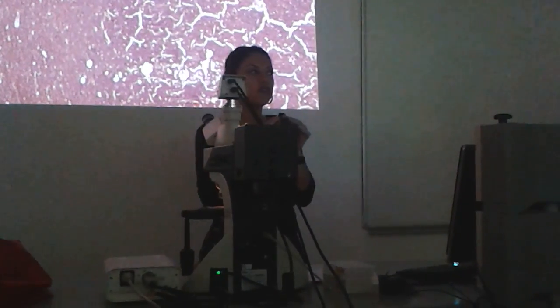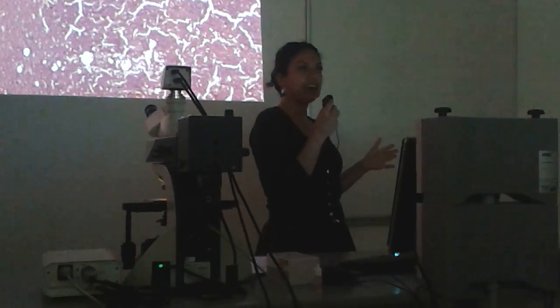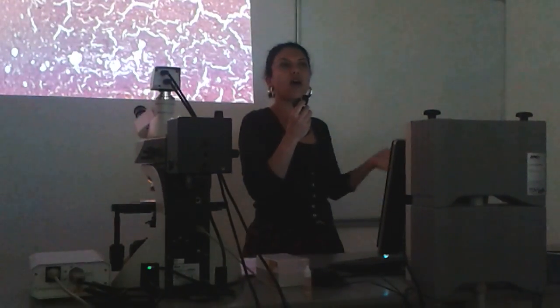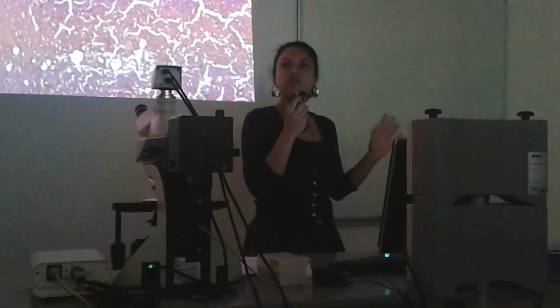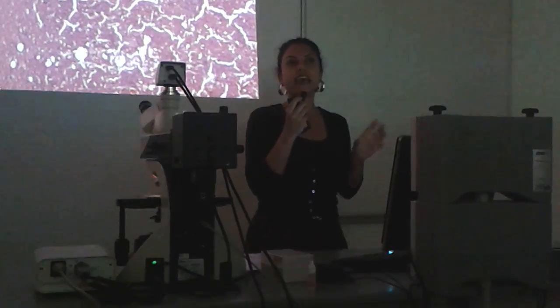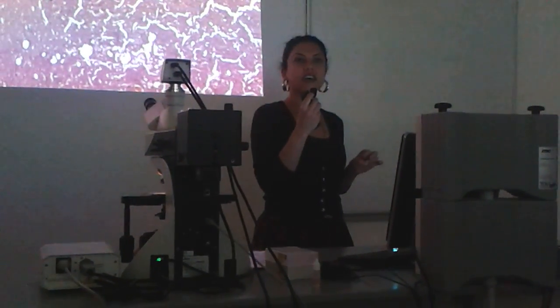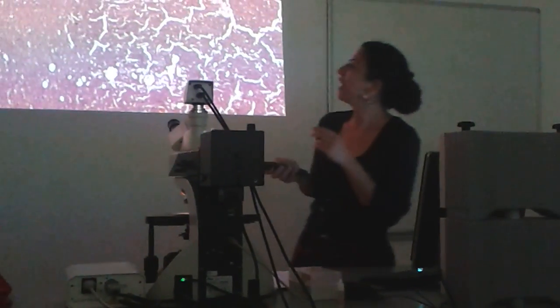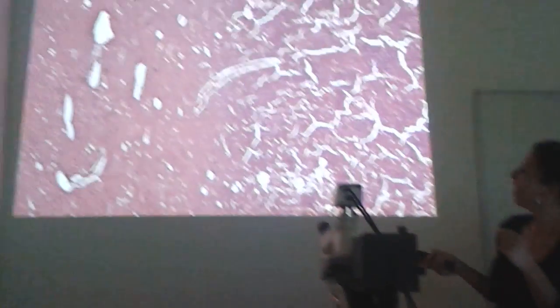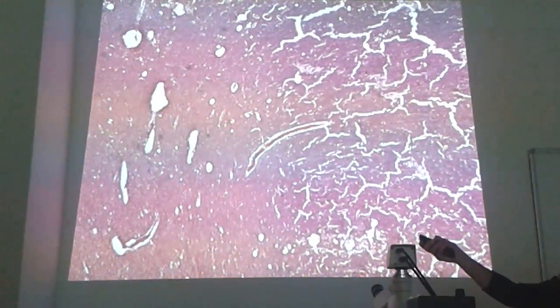These patients have muscular problems, and basal ganglia control our muscle action. So in Parkinson's disease patients, these basal ganglia do not function properly. And these white spaces are all blood vessels.